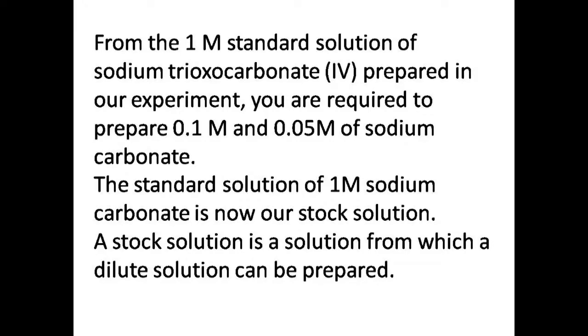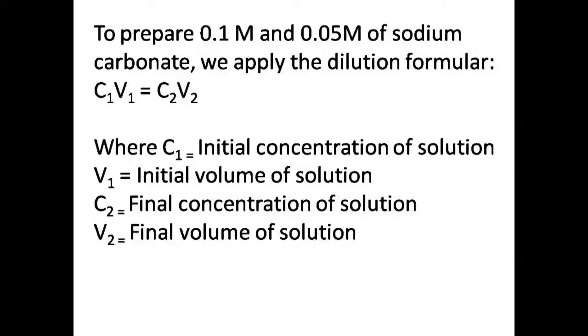The standard solution will be our stock solution. A stock solution is a solution from which a dilute solution can be prepared. It is a standard solution. To prepare 0.1 molar and 0.05 molar sodium carbonate, we apply the dilution formula which you are very familiar with. That is C1V1 equals C2V2, where C1 equals the initial concentration of the solution, V1 equals the initial volume of the solution, C2 equals the final concentration of the solution, and V2 equals the final volume of the solution.